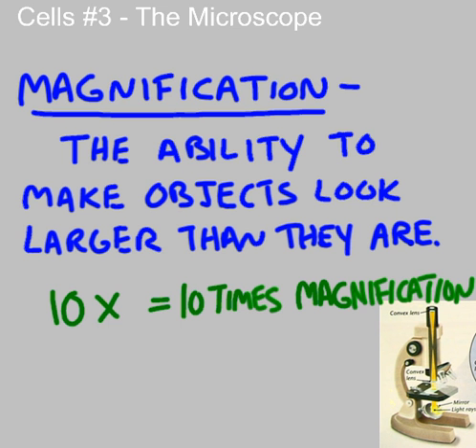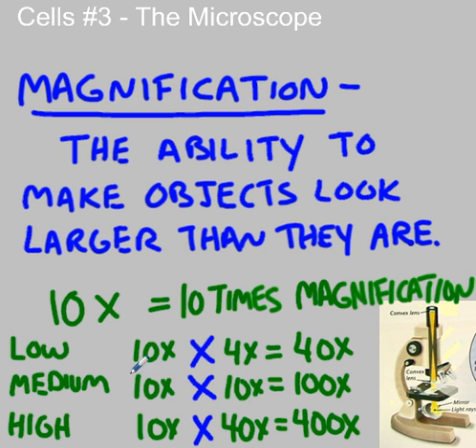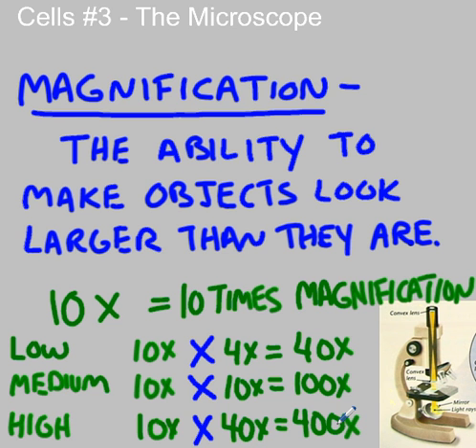In a compound microscope, we're looking through more than one lens, and the lenses multiply. When looking through the low power objective, the eyepiece is usually 10x. With the low power lens — which is the shortest — that's 4 times magnification. 10 times 4 gives a total of 40 times magnification on low power. Medium is a 10x objective lens, so 10x eyepiece gives us 100 times magnification. And on high power, 10 times 40 gives us a total of 400 times magnification.